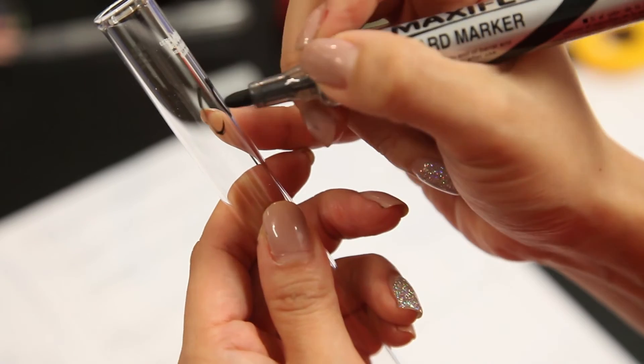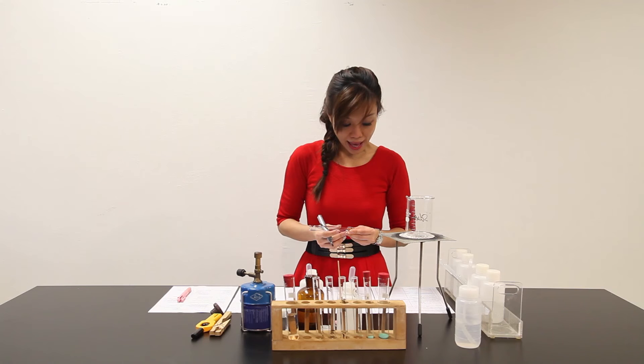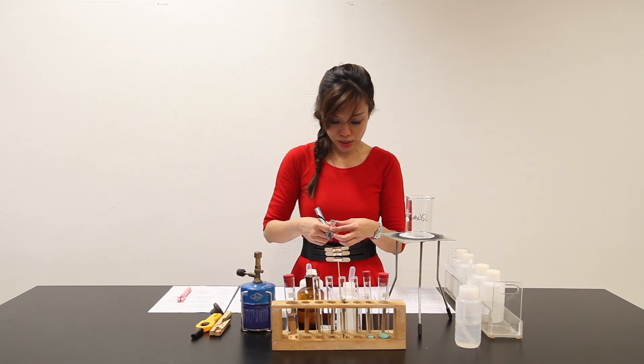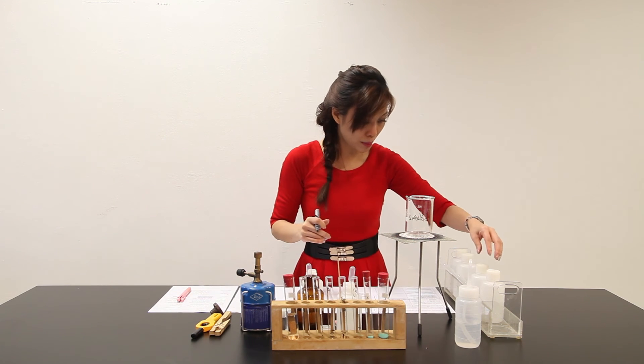Part F: place 1 cm³ of Solution Z in a clean test tube. Add aqueous ammonia slowly with shaking until no further changes are seen. So, 1 cm³, add aqueous ammonia.